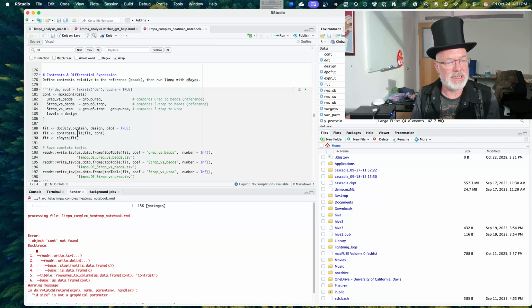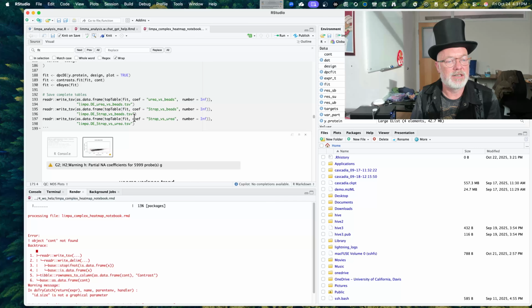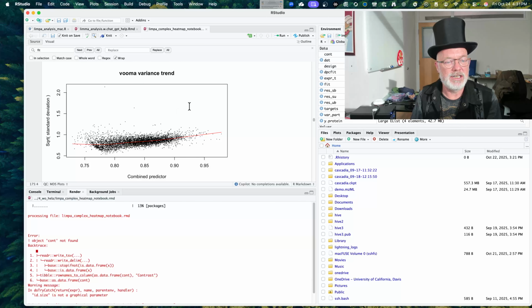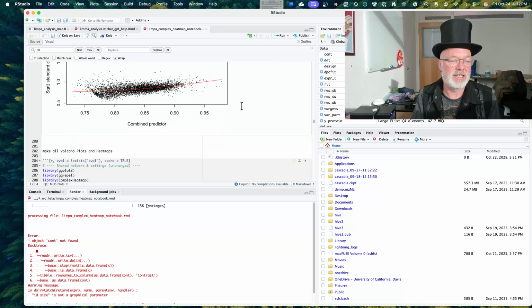And that's what this DPC-DE function does, and this contrast fit and this eBayes, those are part of Limma. But it uses this thing called voom, and I think that was made for RNA-seq. And then these are all the proteins, I think, in the experiment based on the predictor of how often we see them. And this takes into account the errors of the peptide. So think about this as it takes all of these errors and all of these probabilities that we should see them and keeps rolling them forward, right? This is how I understand it anyway.